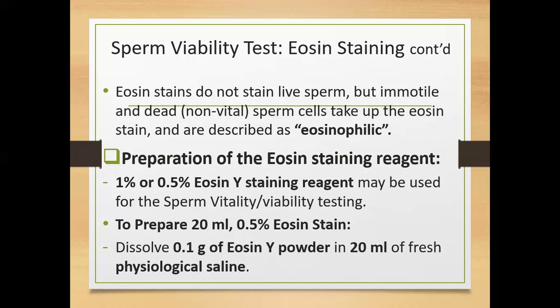So let's take the eosin stain reagent. If you are preparing 1% of a reagent, what does it mean? Eosin, 1%. What does it mean? How do you understand it? That means 1 gram in 100. Great.